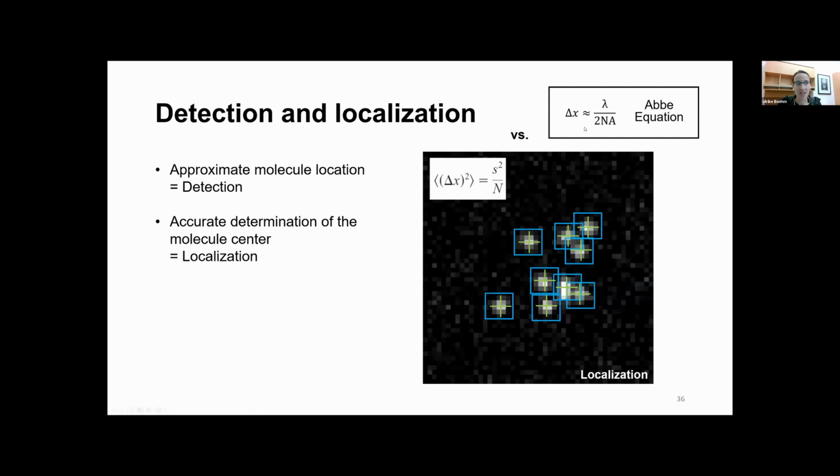So that is more or less a constant. Whereas this equation clearly indicates that the more photons we are able to collect, the lower the uncertainty, and therefore the higher the precision of the single position estimate. And this gives us a way to overcome the so-called diffraction limit, which I mentioned before.